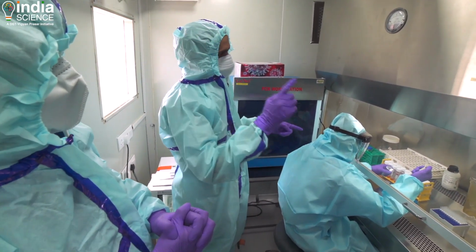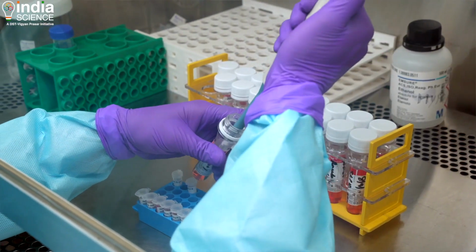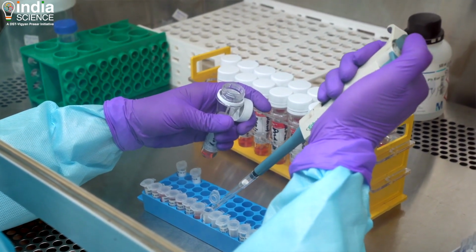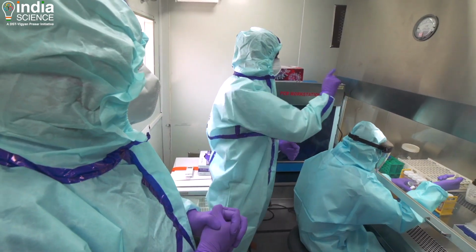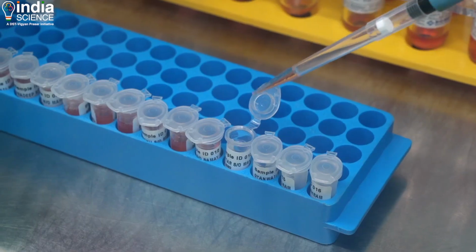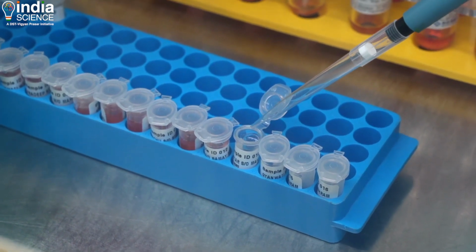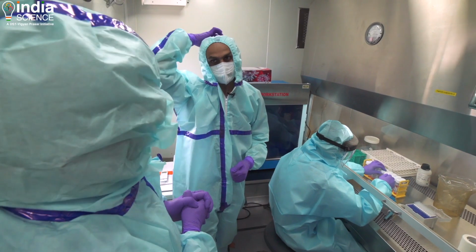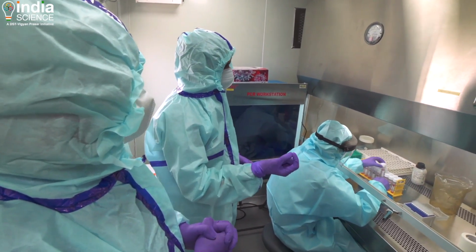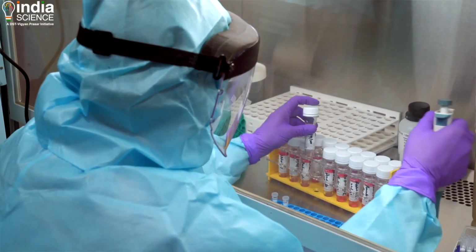So the live virus comes here because we get 2-3 ml volumes. It has to be now transferred to a smaller volume so that we can handle it in our laboratory. That's the first step. So we have samples which are labeled with whatever the patient code it is, and then they are transferred into smaller Eppendorf tubes. From here, then he will add a buffer which inactivates the virus. So that's a buffer which contains detergent as per the RNA isolation protocol. So the first step is inactivating the virus.